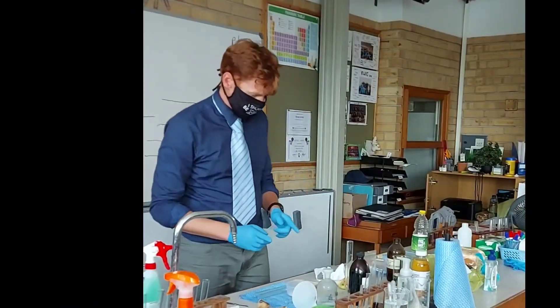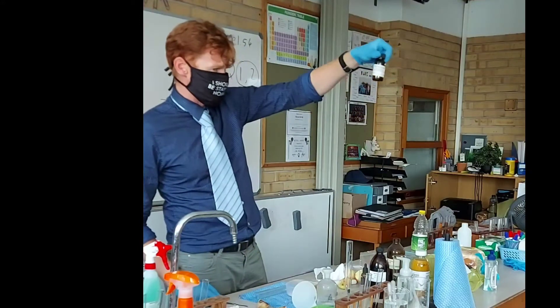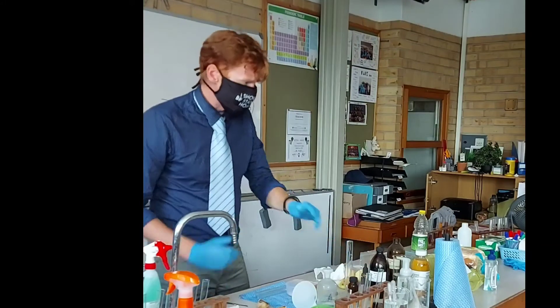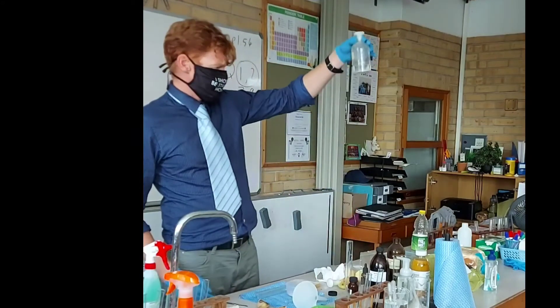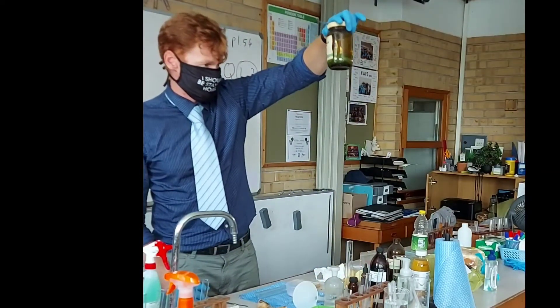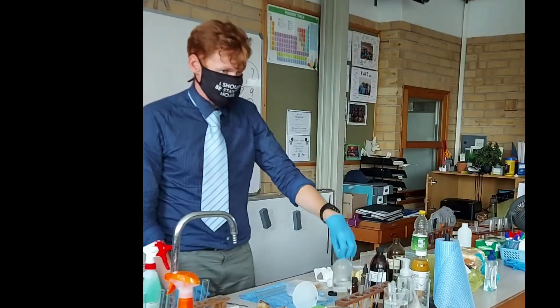Now the Biuret test. The problem here is that we don't have the Biuret solution — it's turned a very ugly color, it's too old. We tried it yesterday and it doesn't work. So we're going to use sodium hydroxide and copper sulfate instead — 1% copper sulfate and 5% sodium hydroxide.